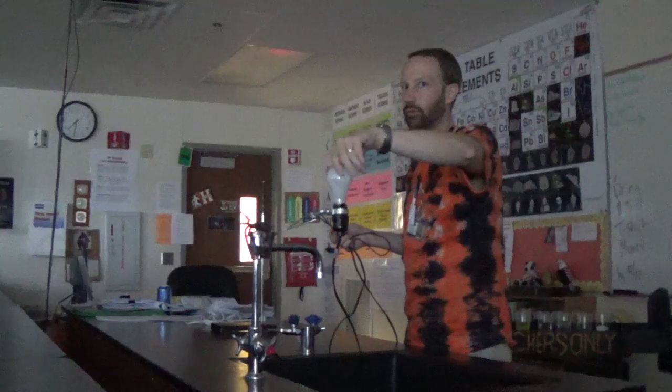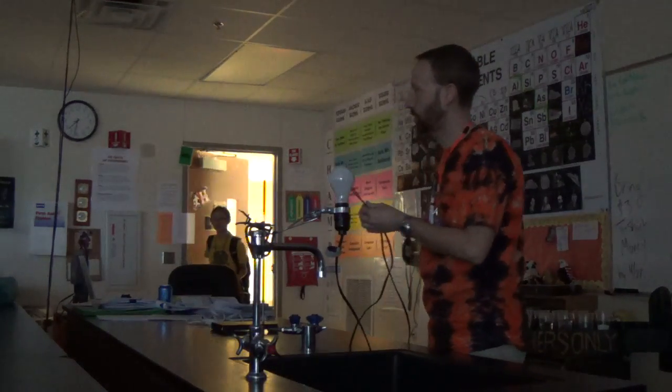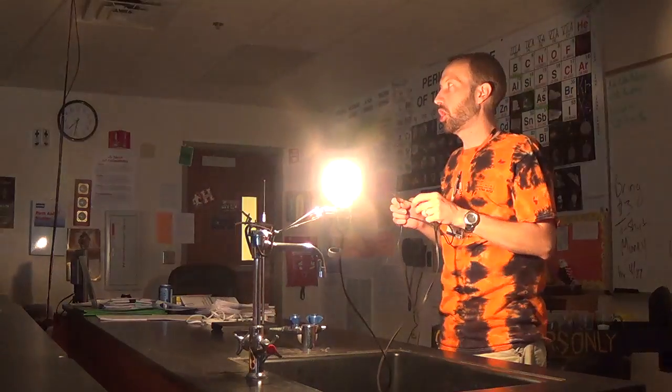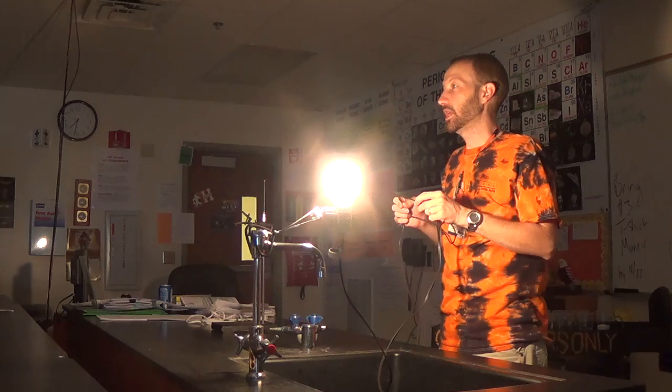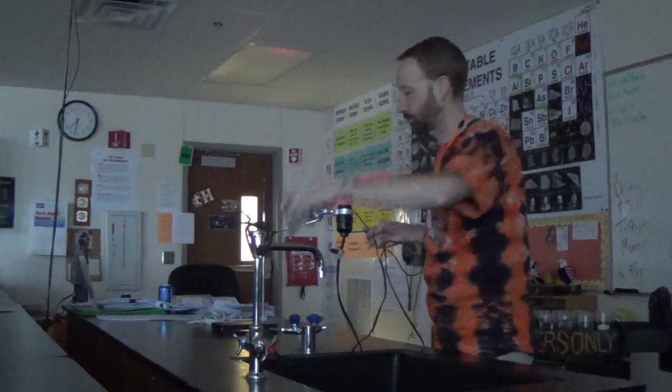And so we will be able to not only distinguish electrolytes and non-electrolytes, we'll be able to distinguish between strong and weak electrolytes. If the 100 watt can light up, it's a strong electrolyte. If only the 34 watt can light up, it's a weak electrolyte. If nothing happens, it's obviously a non-electrolyte.